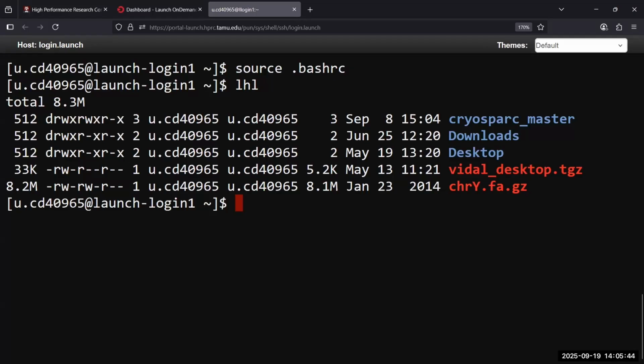Okay, how many people successfully got that done? You need help? Maybe. I see it's command run. Okay, did you run source? Yes, that's fine.